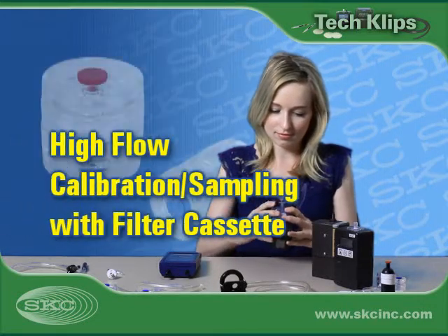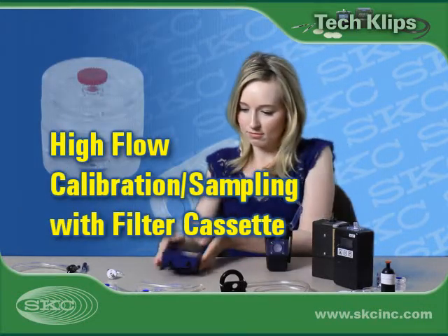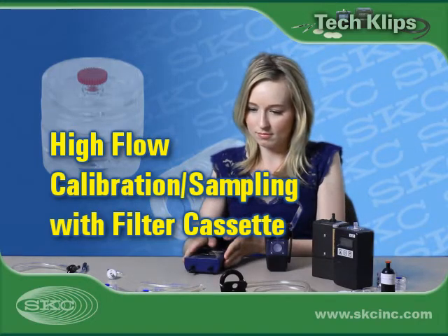Welcome to SKC Tech Clips. Today we'll show you how to calibrate a sample pump for high flow sampling with a filter cassette.